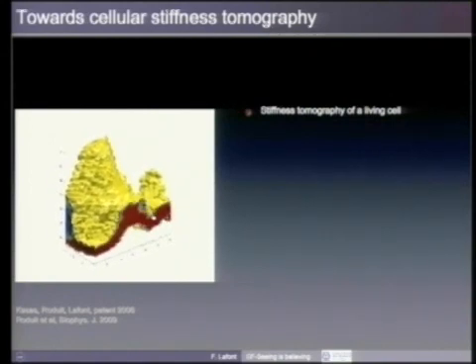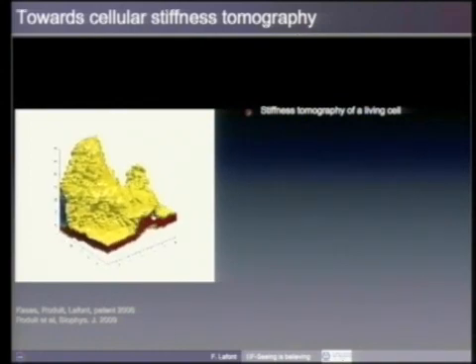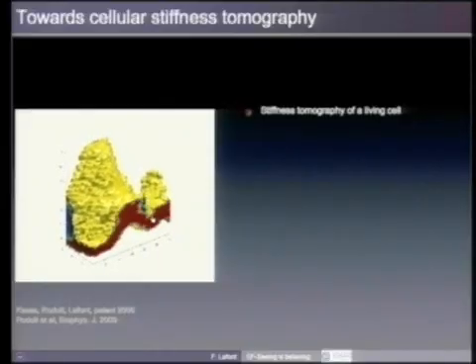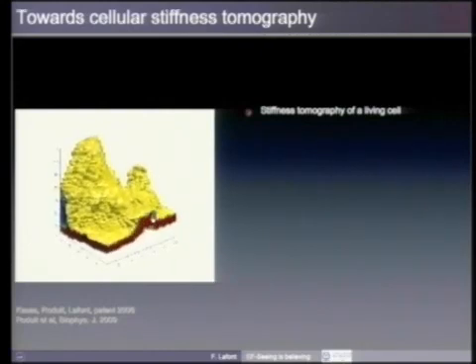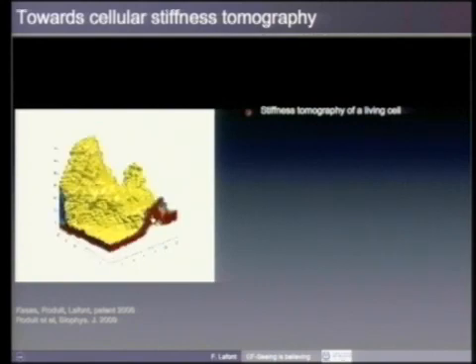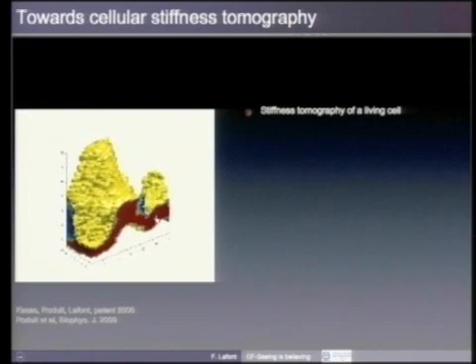So we are currently correlating all these data with imaging in living cells with markers of each of those compartments and elements of the cytoskeleton. So this is also something that can be really interesting. For instance, what we are doing now is using pathogens with actin tail and detecting differences in stiffness because, of course, actin is a structure that is easy to follow.